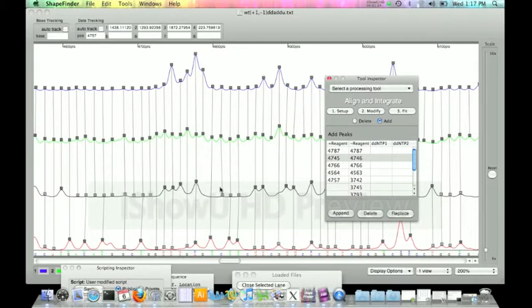Now, after I added that peak, look, we see our 3 U's here lining up with our DDA ladder, no problem. 1, 2, 3, 1, 2, 3. We have another U right here. Sometimes if you have a peak tied to the DDA ladder and the DDU ladder at the same time, it'll give you a little X.